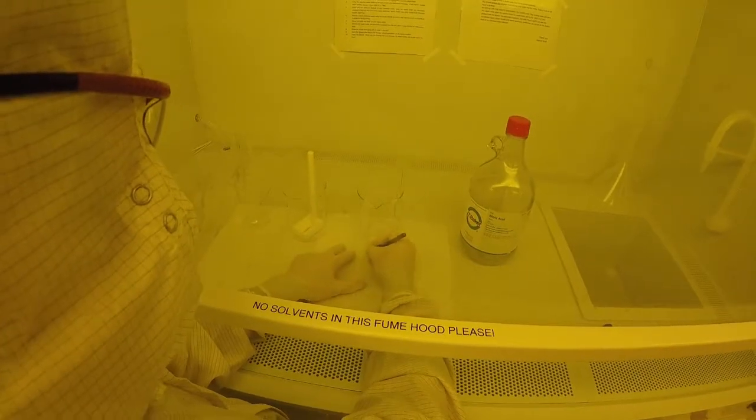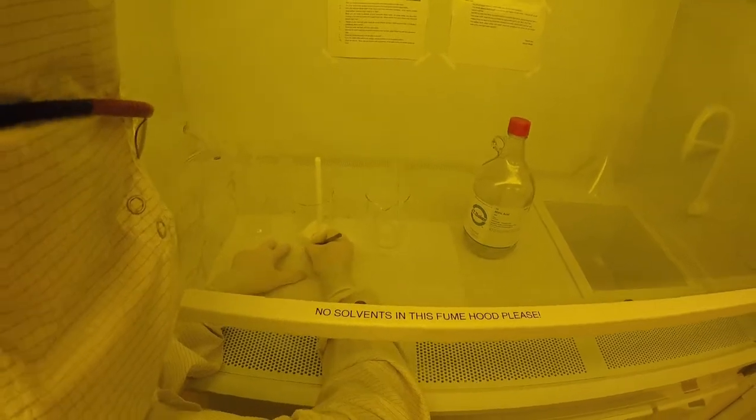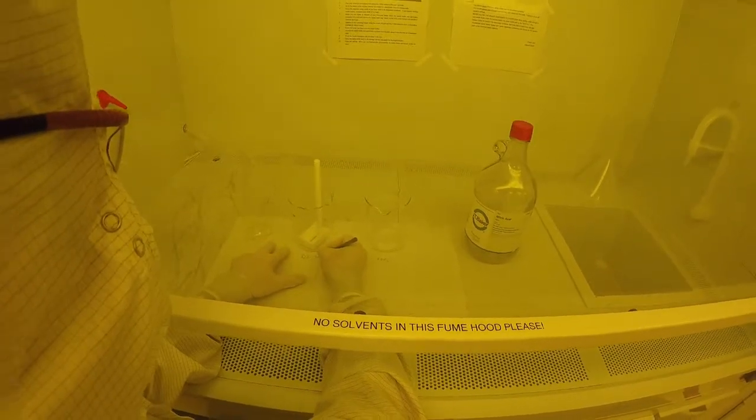Finally, label your work area with your name, contact information, start and end time, date, and the full chemical name next to the glassware in use.